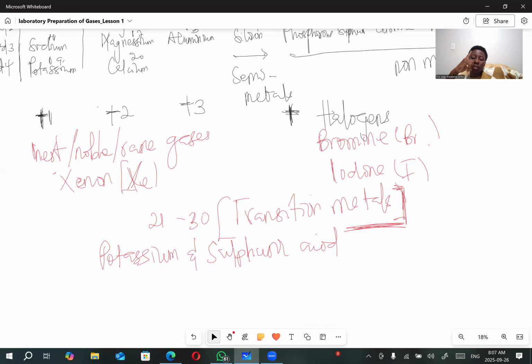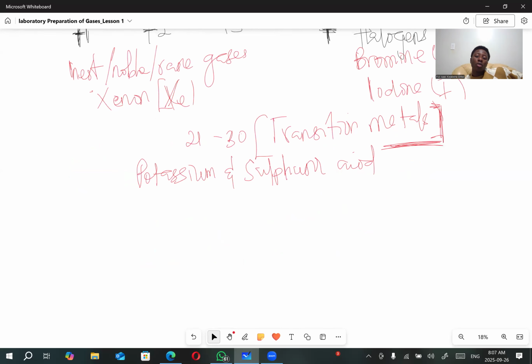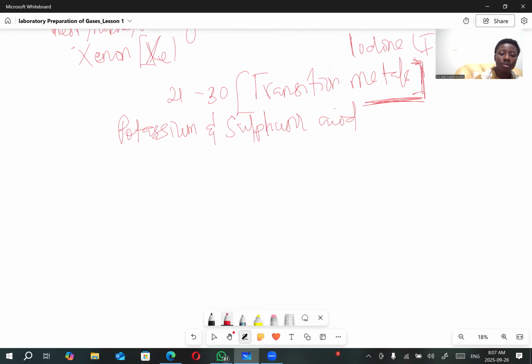There's one more thing we are going to do to wrap up. Test for hydrogen gas. It's a question they'll ask you.